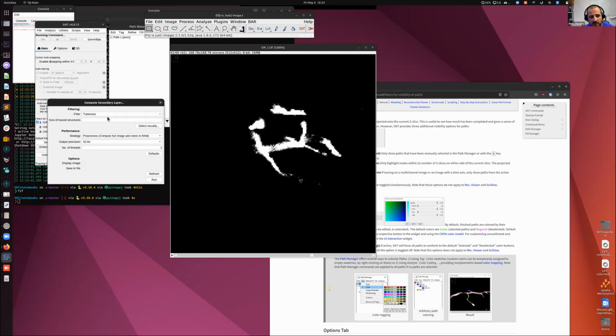Again, you have to read in the documentation what they are, but these are basically filtering operations that try to detect tube-like structures on the image, which pretty much all neurites look like, and they will try to enhance those, bring them to the foreground, and give a penalty to everything that doesn't look like a tube. So let's say, for instance, in this case, we can use the tubeness filter. To get technical, in case you are interested, we are using ImgLib2 Ops. Some of the filters we have implemented ourselves.